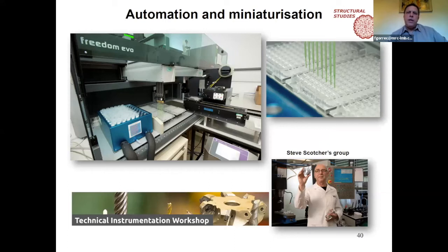The way we do initial screening at the LMB is that we supply pre-filled crystallization plates. The kits in tubes are aliquoted into crystallization plates, which are stored and made readily available to the user, which is good because you never know when the sample will be ready to be used, freshly prepared.